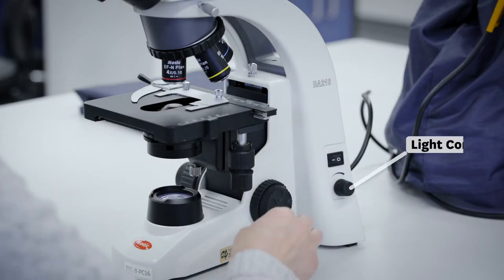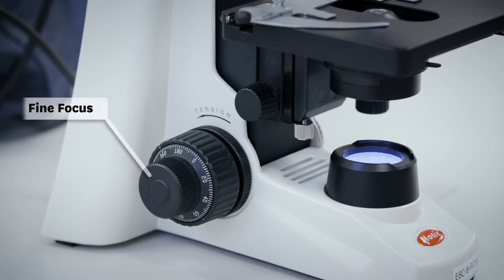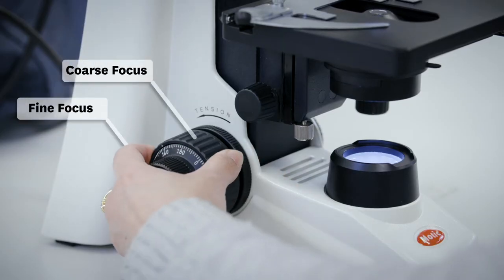The light intensity is controlled by the dial under the power switch. Rotate the coarse focus knob to bring the stage to the lowest position.